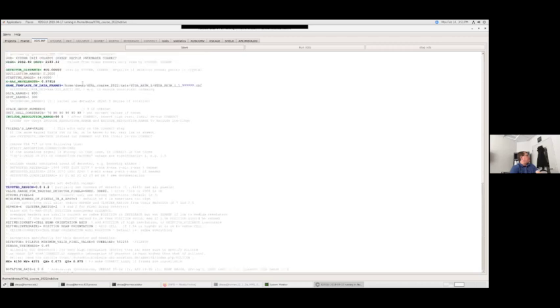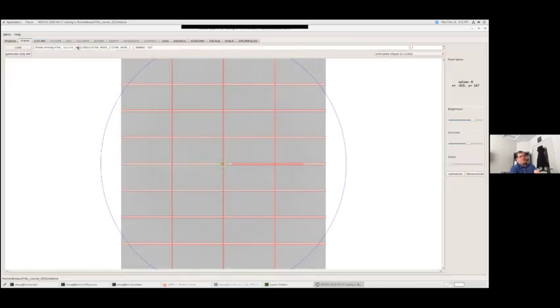And in here, it kind of highlights the important things that you want to check in green. So the beam center given in pixels, org X, org Y, the detector distance, and then between that is the oscillation range and the starting angle and the X-ray wavelength. Okay. Here, I don't have to worry about the name template of data frames because I generated the XDS after loading in an image, so it knew where to find that image.